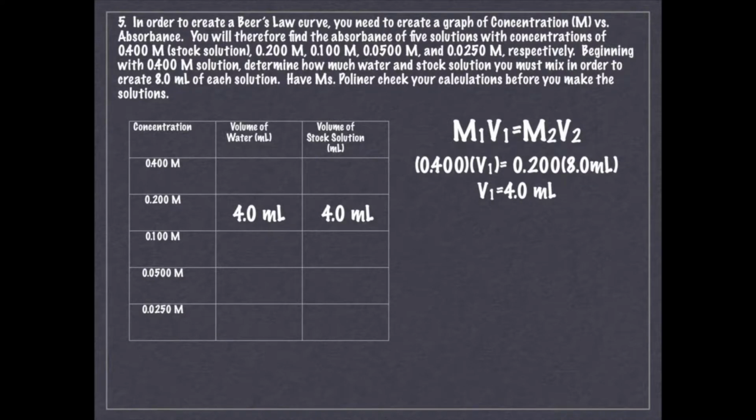So you're going to do this calculation now to create a 0.100 instead of 0.200 molar solution, then a 0.05, and then a 0.025. All right, and then have me check your work.